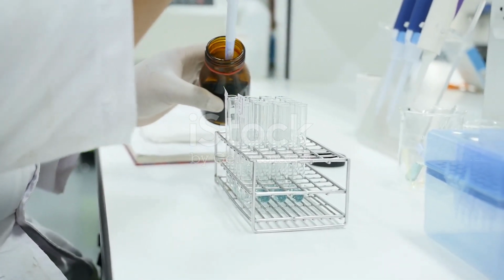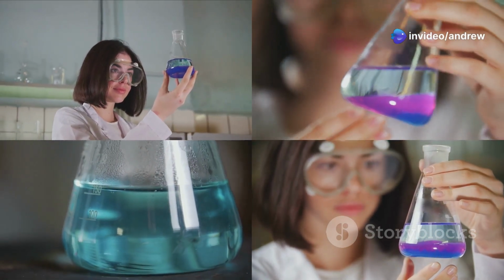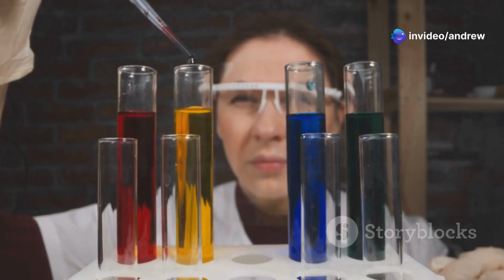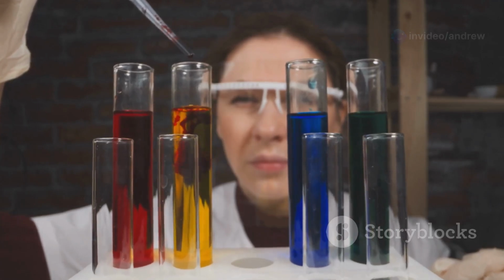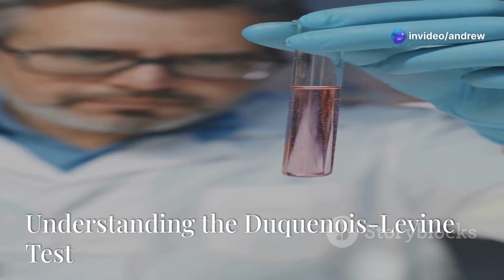Observe the sample closely. If cocaine is present, the initial reaction with Scott reagent part A will produce a blue precipitate. Next, add a few drops of Scott reagent part B, the concentrated hydrochloric acid, to the sample. If cocaine is present, the blue precipitate will dissolve, resulting in a clear pink solution.